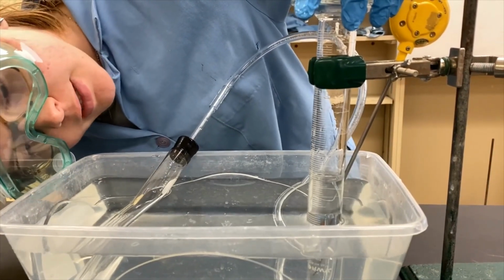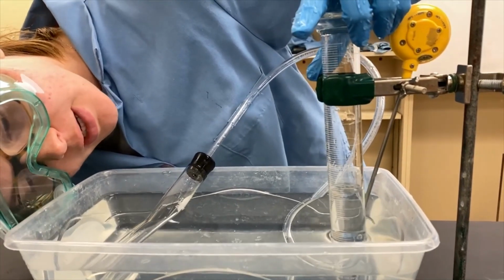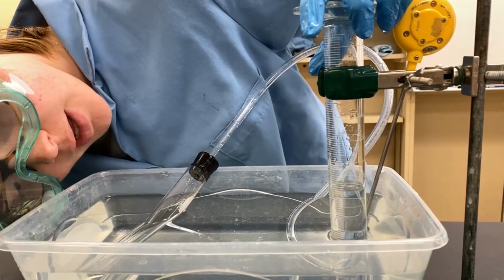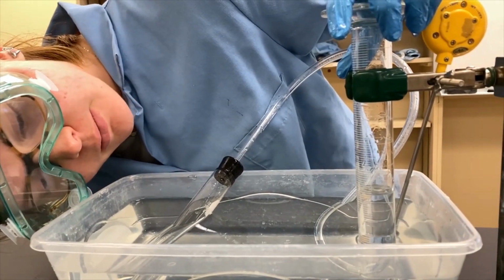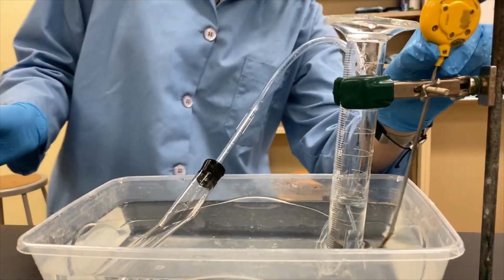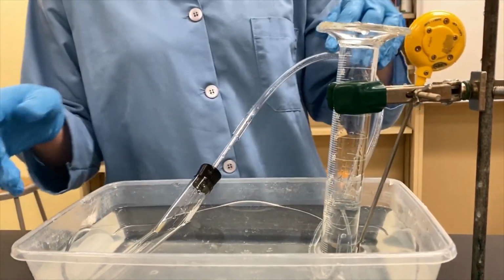So we want to make sure the lines are lined up and that it's even and level with the ground. We're going to have about 71.9 milliliters of CO2. And then our temperature of the system is 22.9 degrees Celsius.